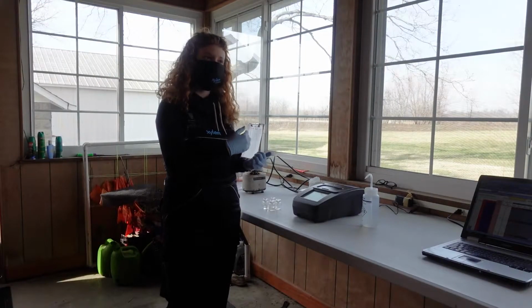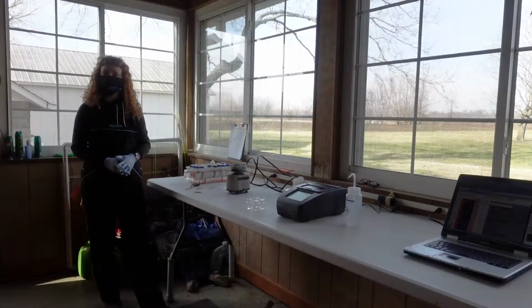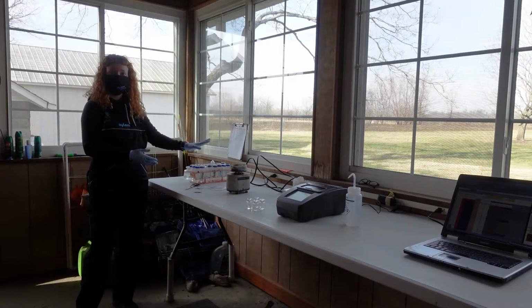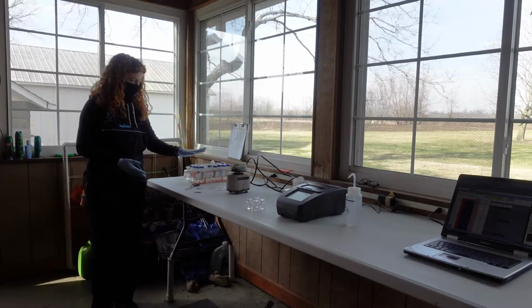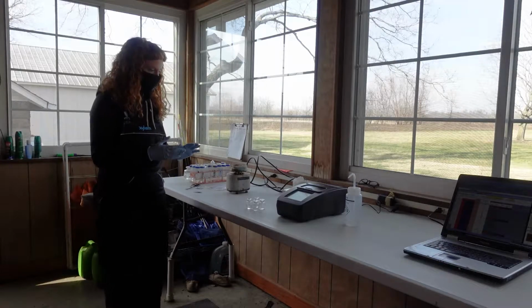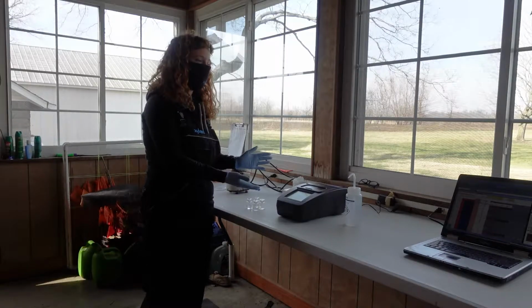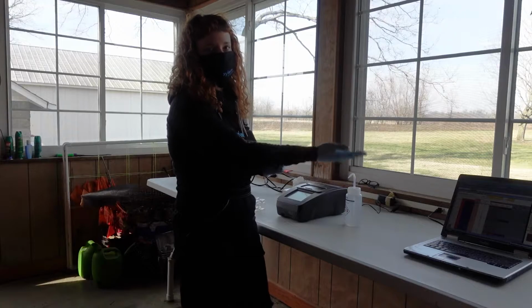Now let's take a closer look at how you will pour your samples and what that will look like when you come in for the day. So when you come in for the day, there will be a couple things ready for you to run your nitrates test. The first, you'll find tubes that will be labeled for the nitrate test. We'll show those in a second. We have a vortex machine, which will help you to spin the samples as you're reacting. A photometer, which is where we will measure the samples once they've been reacted. And then finally, your results will be entered into the computer, into our nitrates spreadsheet.